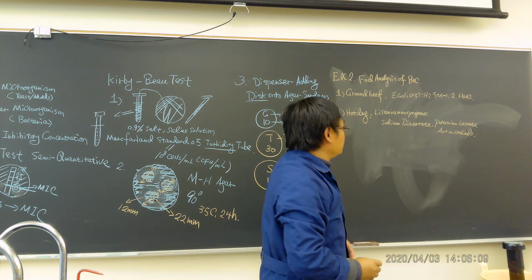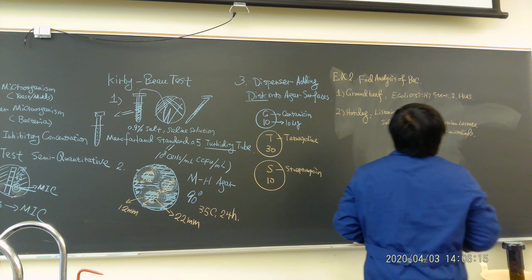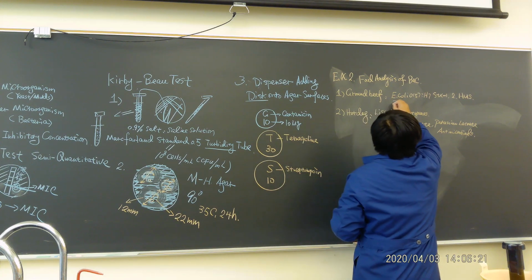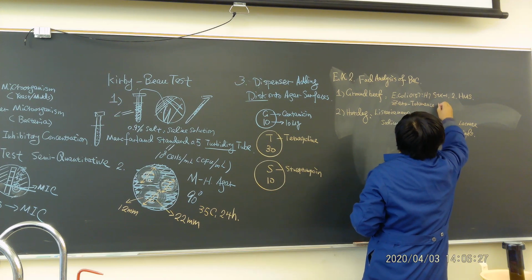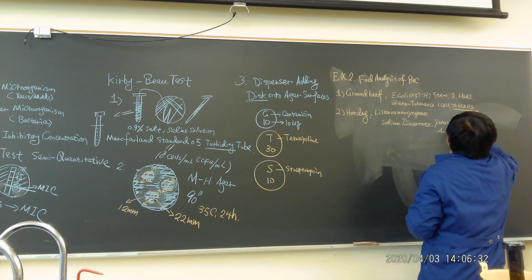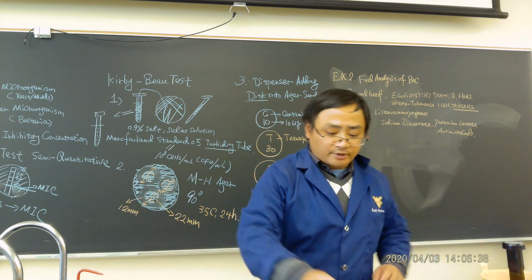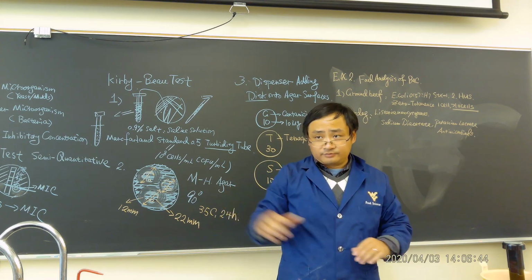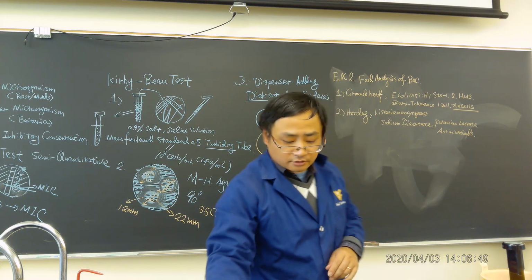Remember the 3 alternatives to control Listeria on ready-to-eat meat we talked about on the slides? Those are antimicrobials. Ground beef basically does not have any antimicrobials, and the requirement is zero tolerance. You should not have even 1 cell, and if you have more than 10 cells, that's not good. This is going to cause people to die. Remember the lecture, the uncooked hamburger at Jack in the Box killing 4 kids? That story comes from E. coli O157:H7. So I'm going to show you how we're going to do it.